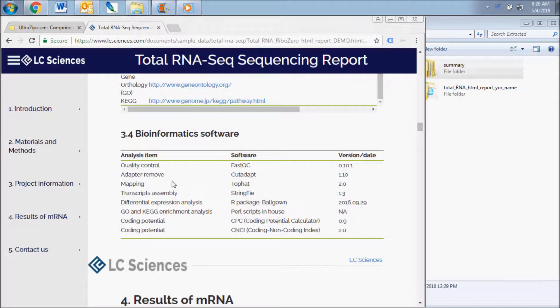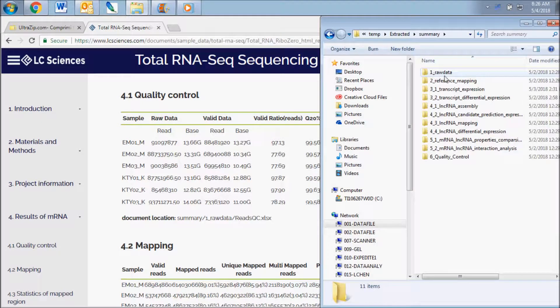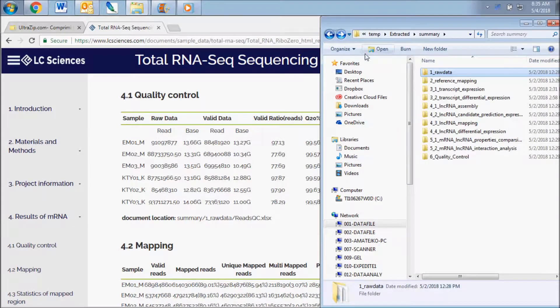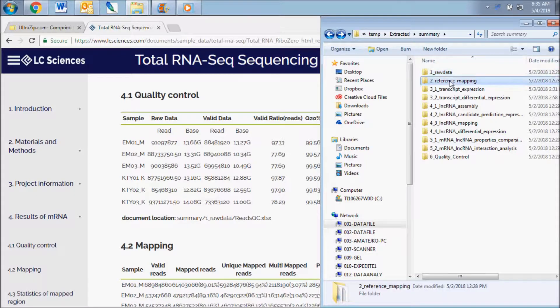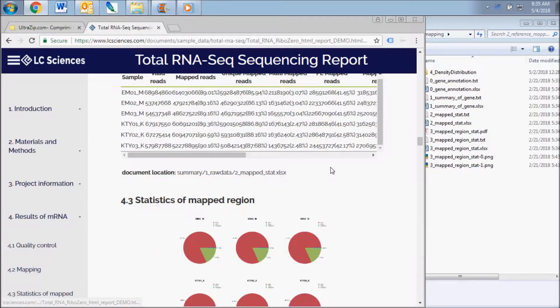The first results section of this report contains the messenger RNA data. The first results subsection displays data contained in the raw data folder. This includes the raw sequencing reads and quality scores for the reads. The next results subsection displays data contained in the reference mapping folder. This includes the read mapping data, mapping rate statistics, and the read localization on each chromosome.